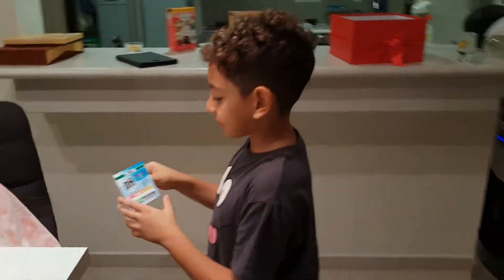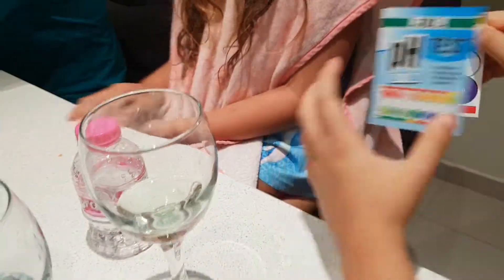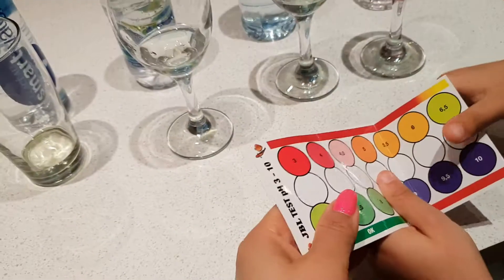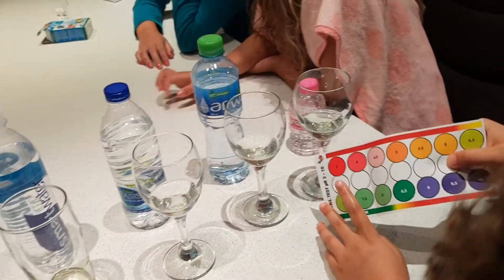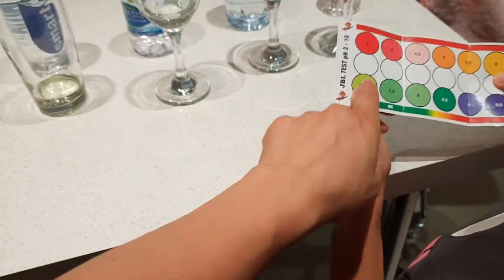Gently, gently. The first one, which is Larynx — let's see, it's hit pH 6.5. You can tell from the color. The next one, I would say it's more towards eight to be honest — seven to seven point five to eight for this. Arwa — a bit less, so yeah, seven-ish, between 6.5 and 7.